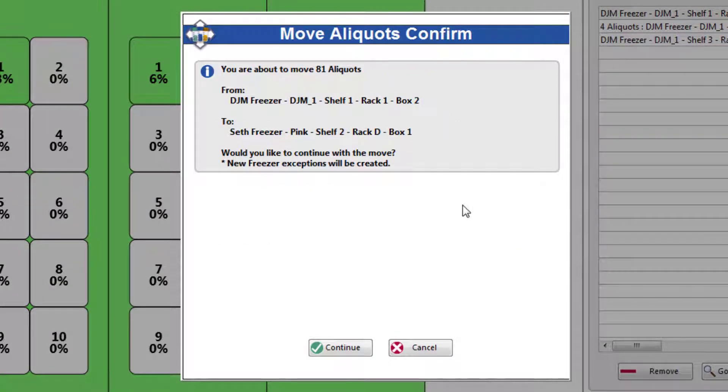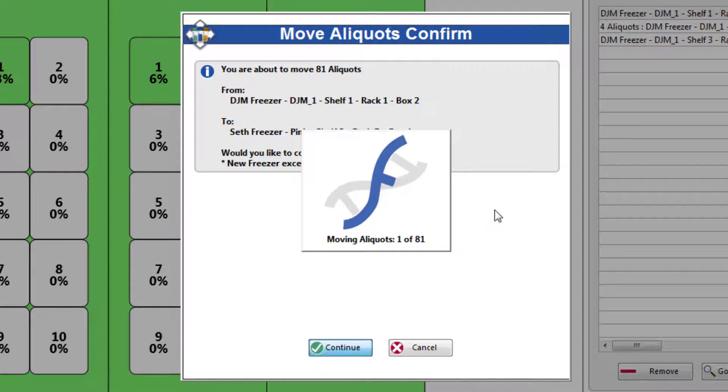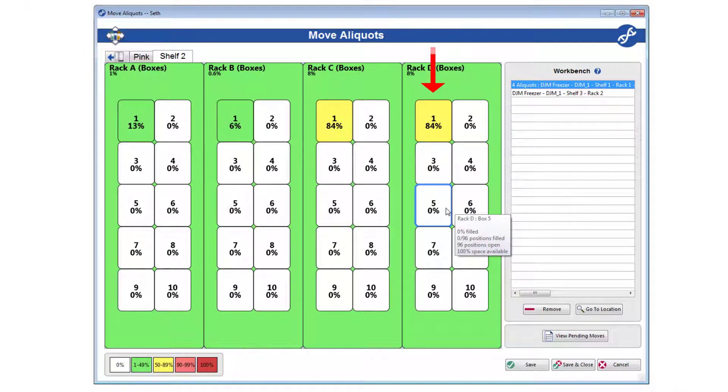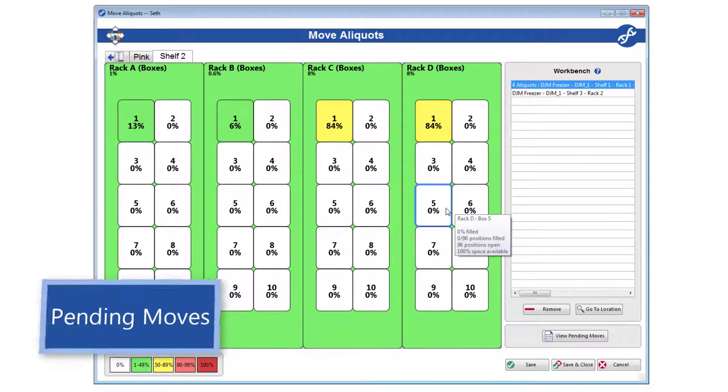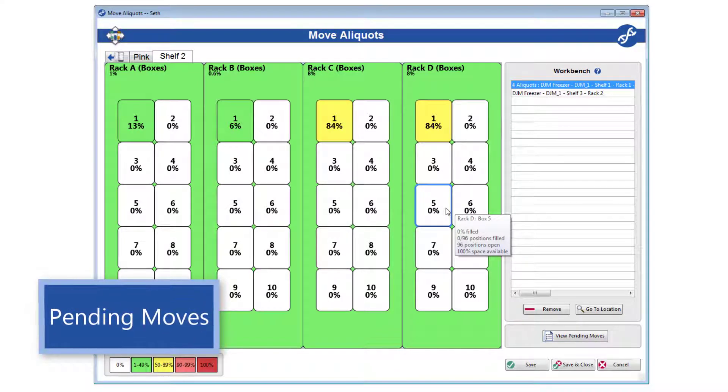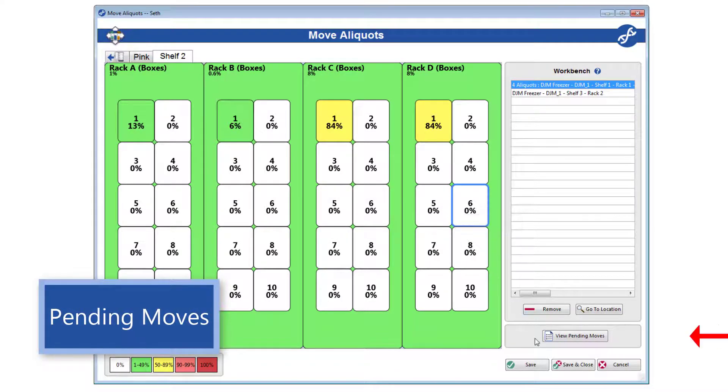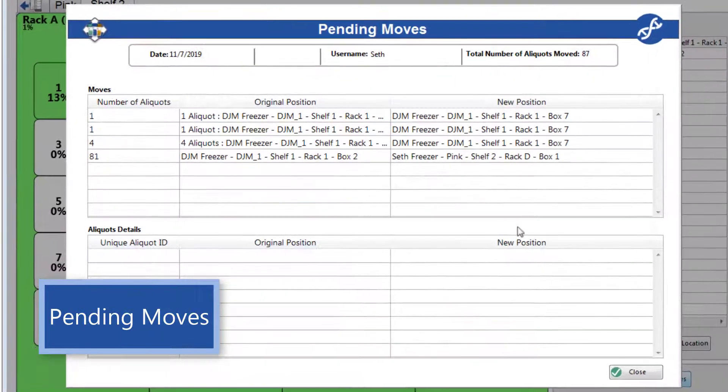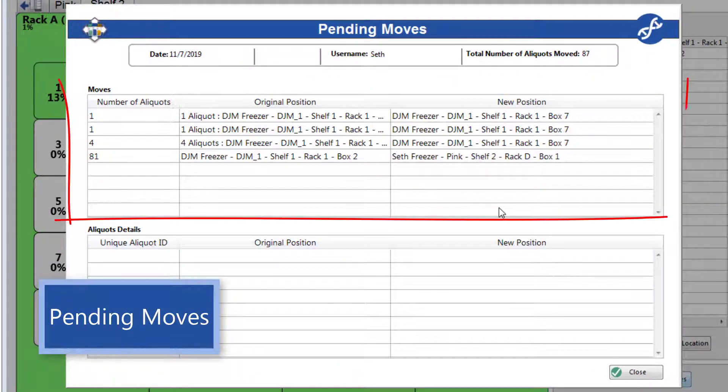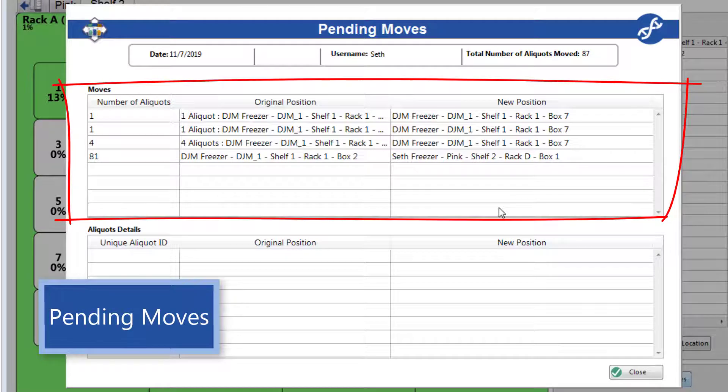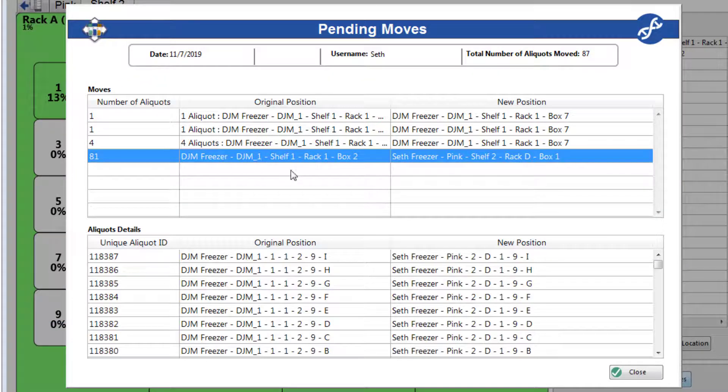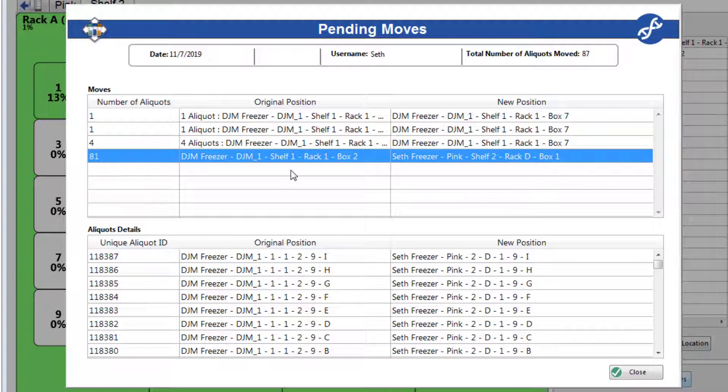When you are ready, click continue. And the move is completed. The picture updates, but the move is not yet saved. The move will instead be added to the pending moves list, which you can access at any time by clicking View Pending Moves. Your pending moves will be in this first list box. Highlighting one will populate the second list box with details for every aliquot involved in the selected move.